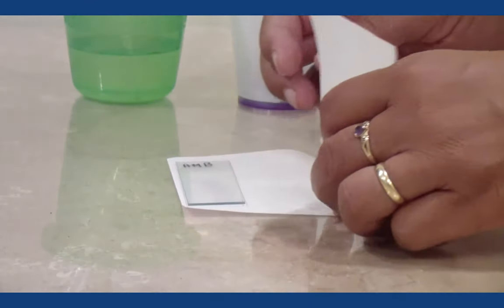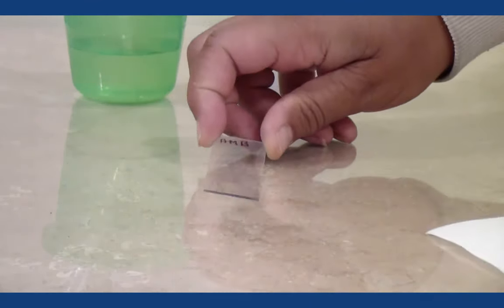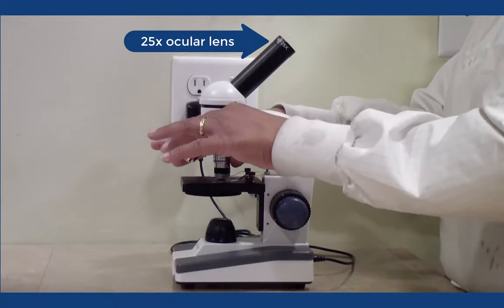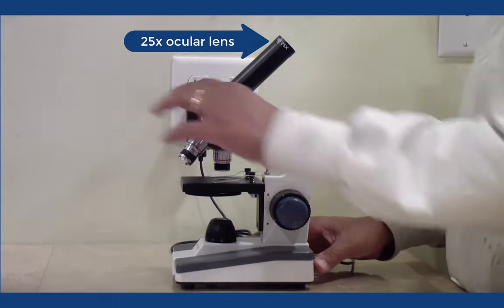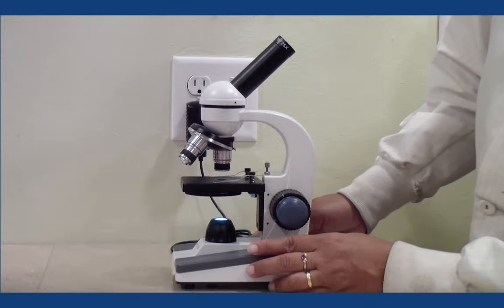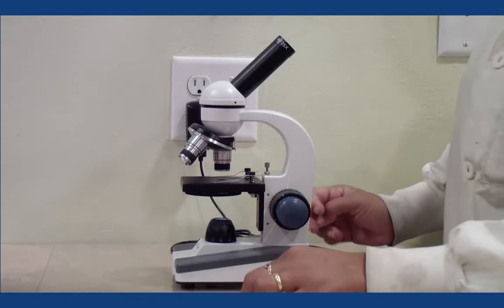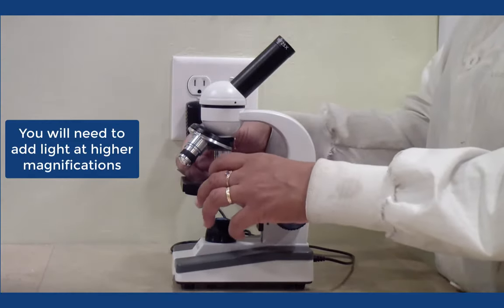Now your slide is ready for observation with the microscope. You will need the 25x ocular lens for this activity. Place the slide on the stage, start with the 4x objective lens and low light, focusing with the coarse focus knob.